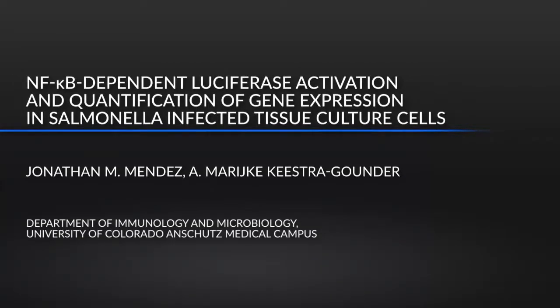This protocol is useful for determining changes in NF-kappa-B activation in cells expressing an NF-kappa-B luciferase reporter. The main advantage of this technique is it allows for a high-throughput screen of factors or conditions that lead to changes in NF-kappa-B activation.